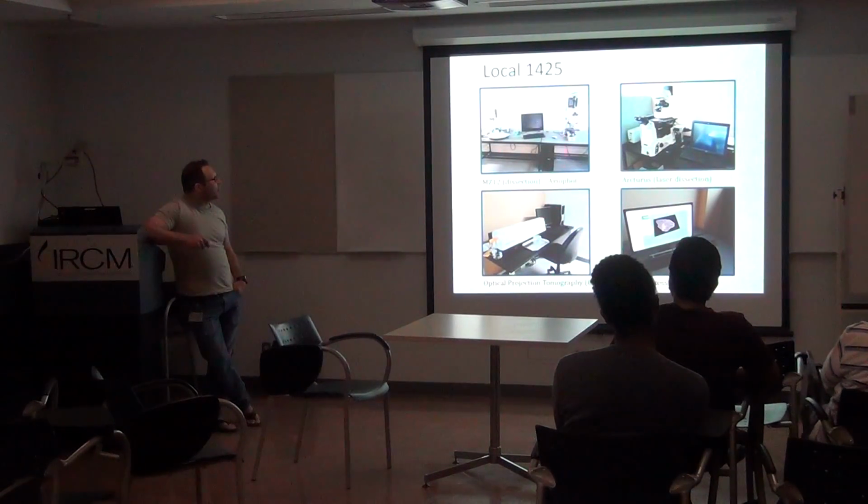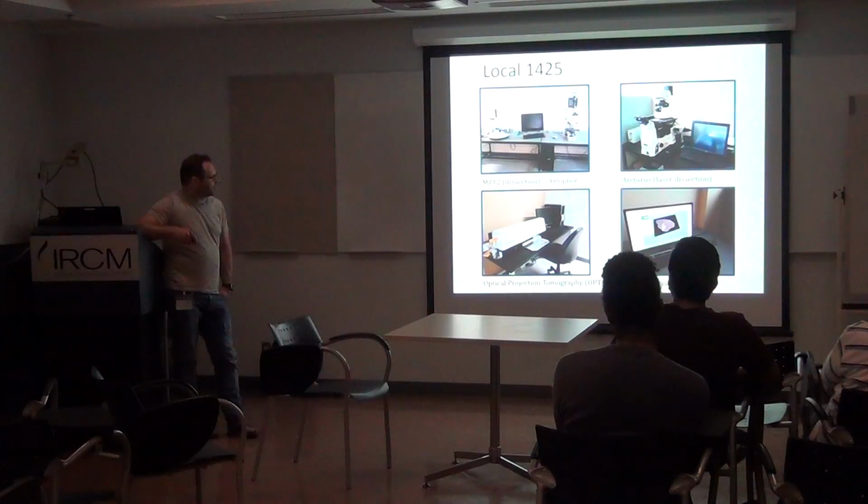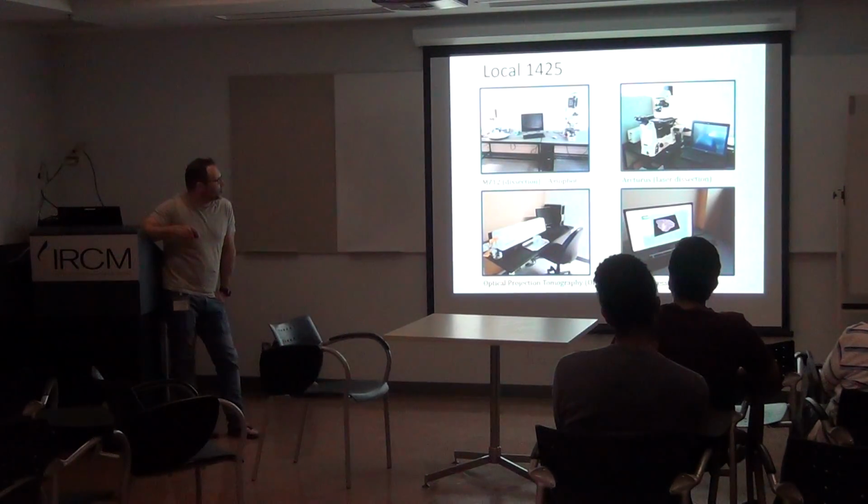This is just a regular bright field microscope. This is an optical tomograph. You can put your specimen here, and there's a motor which will make it turn, and the optical system is still here, so you can produce 3D also from this. This is just an image processing workstation.